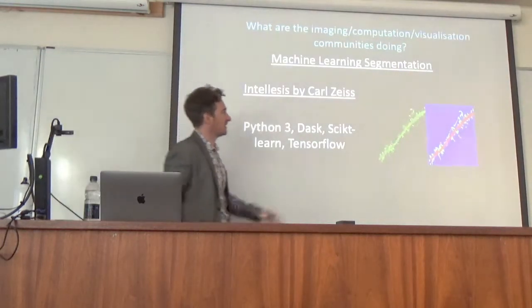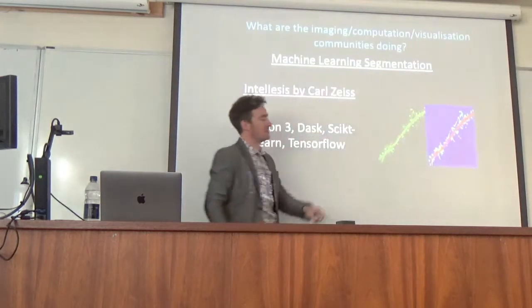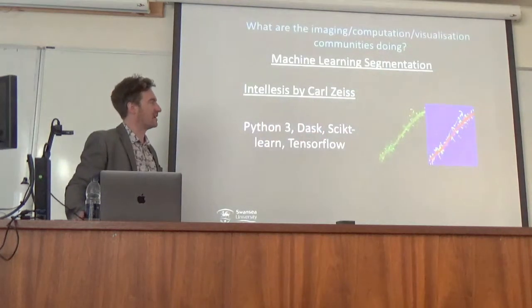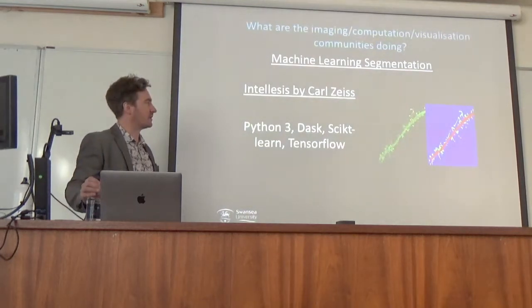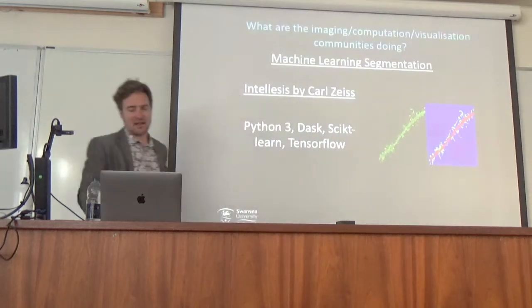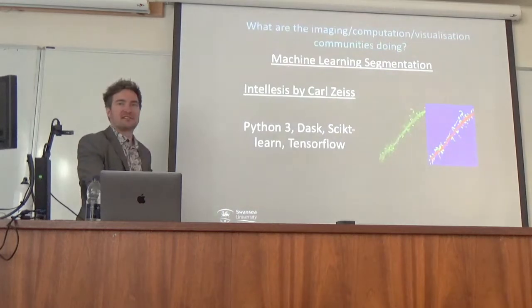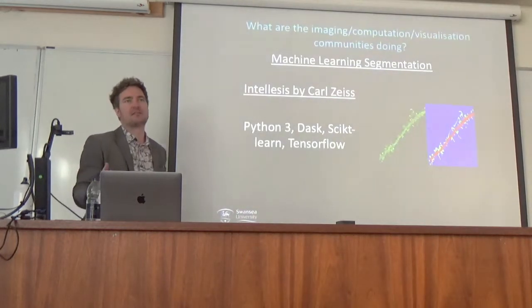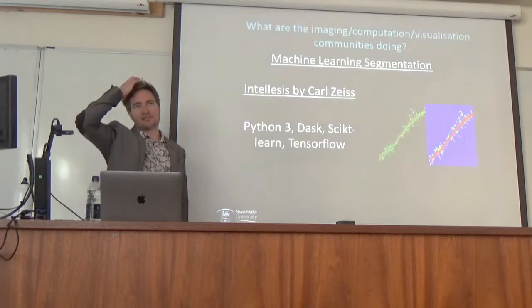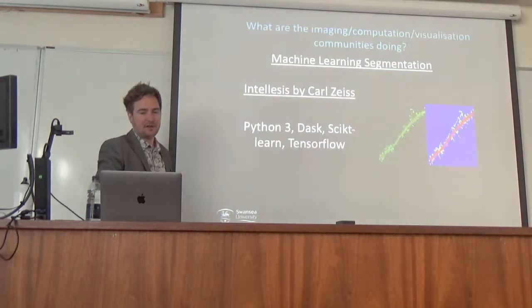And so it's looking at, ultimately, these are the same color. You have some brightness differences, but effectively, based on its color from fluorescence imaging, that would be a difficult one to segment into the main spine and these dendrites that come off. And so it's able to pick things like that. We've been using it for the more challenging porosity examples that we have. Usually porosity would be easy, but actually with FIB-SEM data, so SEM data, that's not as straightforward. So they're just some of the little tools that I think are good or we are using.